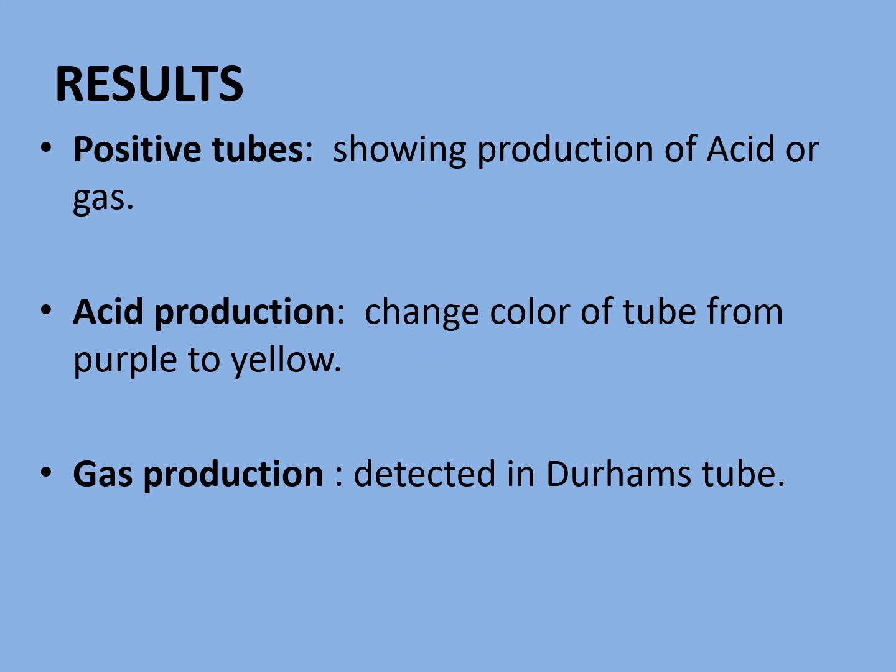Results: after incubation for 24 to 48 hours, the medium turns from purple to yellow due to lactose fermentation, along with turbidity of the medium, and gas is collected in the Durham's tube.